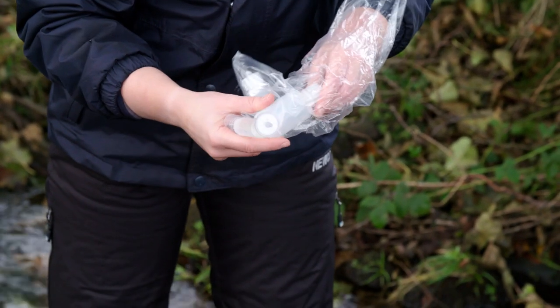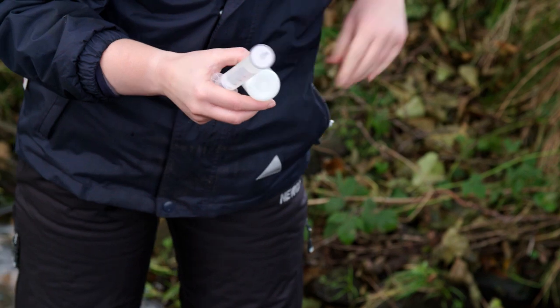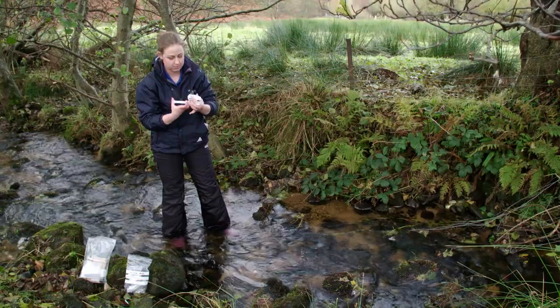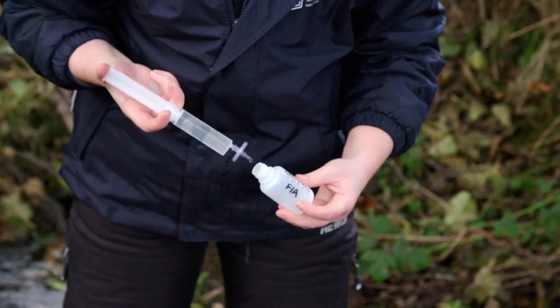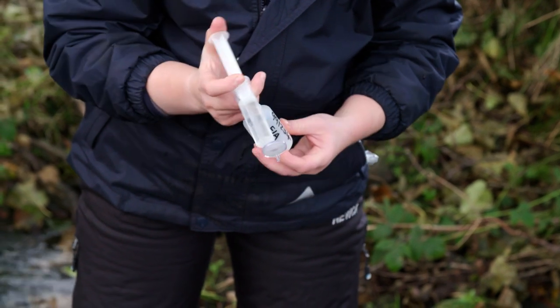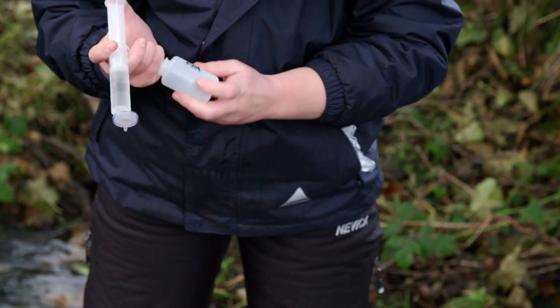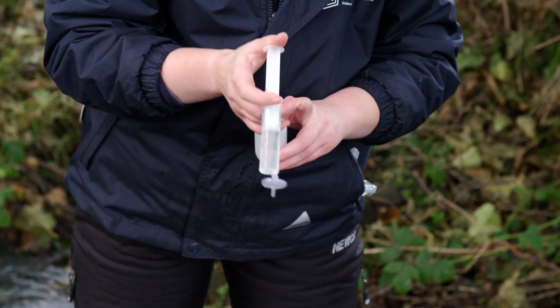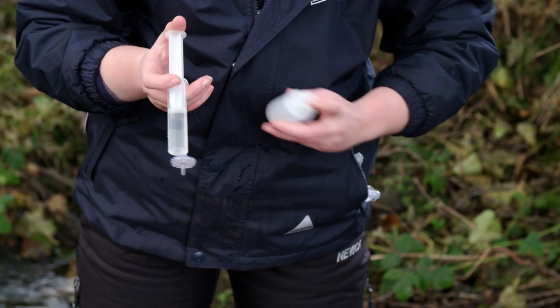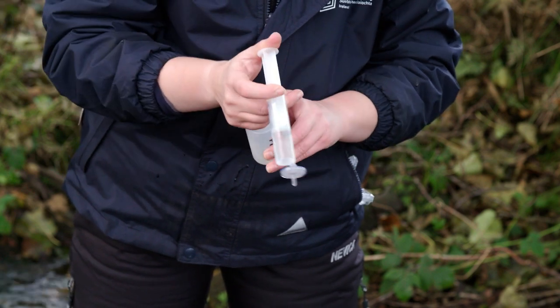Now remove the bottle marked FA from its polybag. This should always be the first water sample you collect. First, pre-rinse the bottle: remove the cap and, using the syringe, put a small amount of filtered water into the bottle. Replace the cap, shake the bottle and dispose of the water. Repeat this process three times. When removing the cap, ensure no unfiltered water, dirt or your finger comes into contact with the cap or the inside of the bottle.